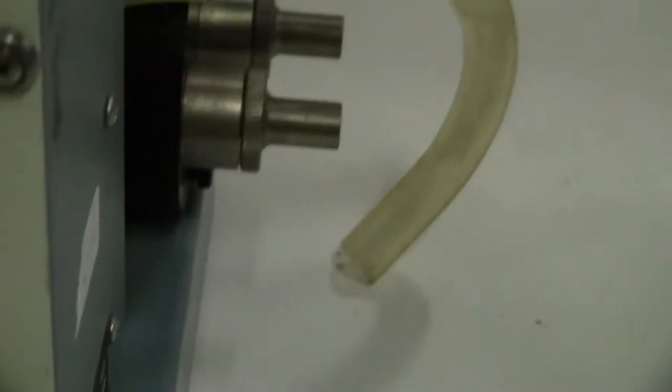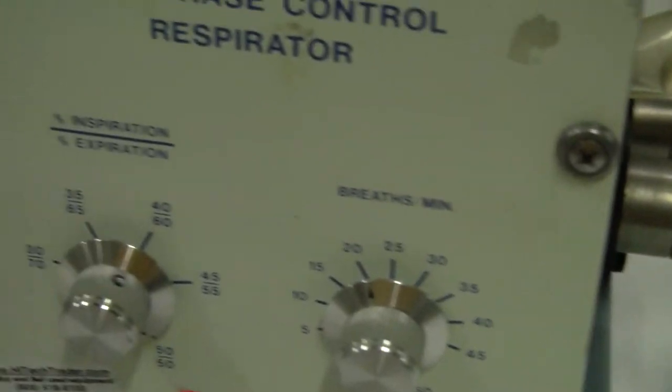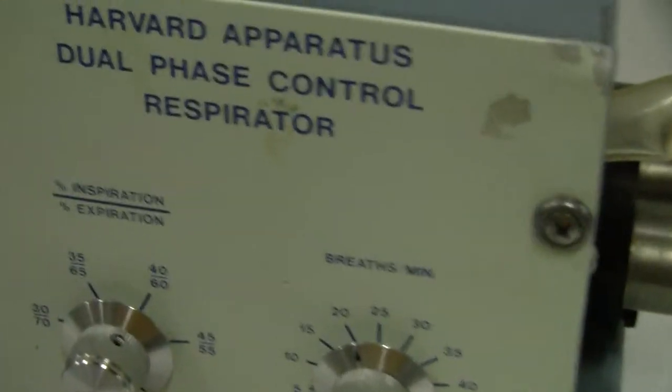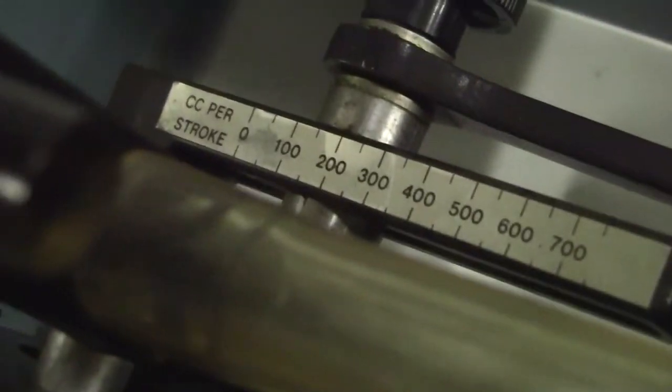You can adjust the breath per minute and the percent of inspiration and expiration. Slide to change the cubic centimeter per stroke.